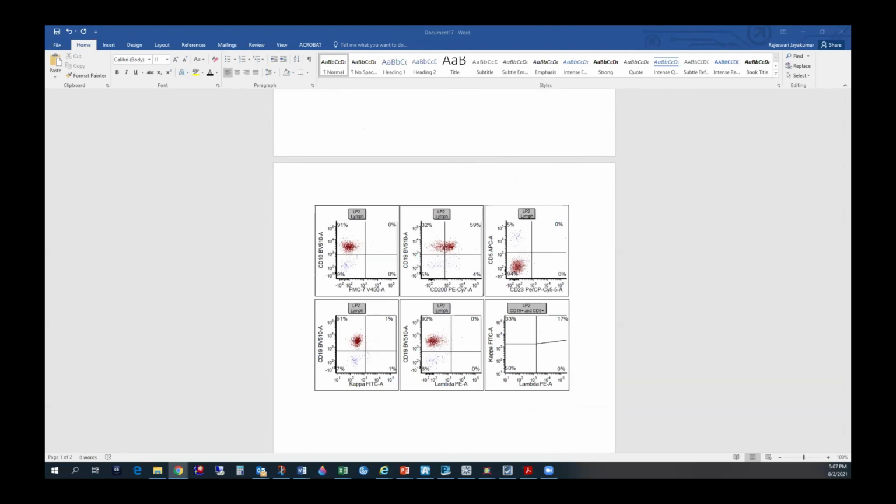Okay. And then one more question from another case with CD27. Which cells can be positive for CD27? Is it specific for anything? It is only done in plasma cell neoplasms. CD27, CD81, CD200, CD117, all of these are aberrancies that you look for in plasma cell neoplasm.